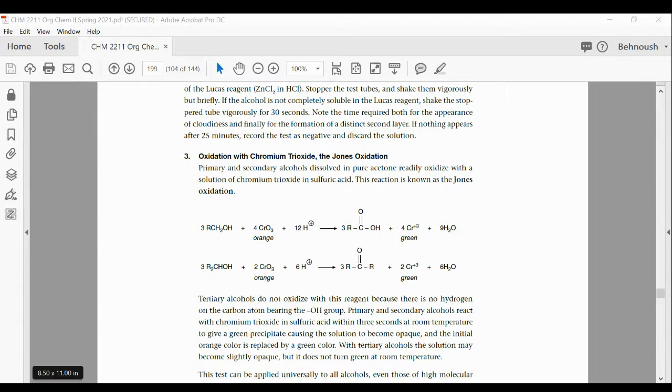And then for the abstract, you could say the tests that you performed for hydrocarbons, and what the results were, and the tests that you performed for alcohols and phenols. It's kind of a short summary, not in detail, just a short summary of the tests that you have performed, because you don't have numbers. So I'm not looking for numbers, but still I want to see the data collected in a table, the way that it shows on page 192.